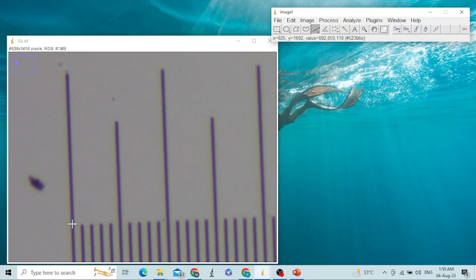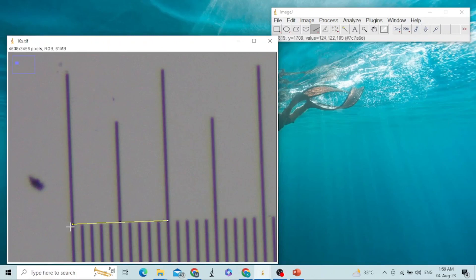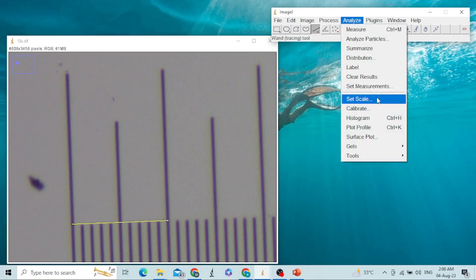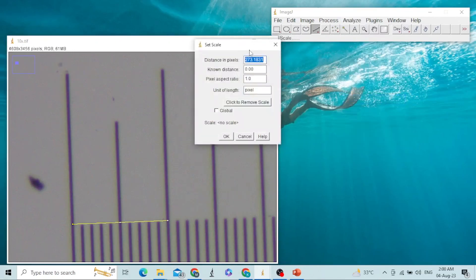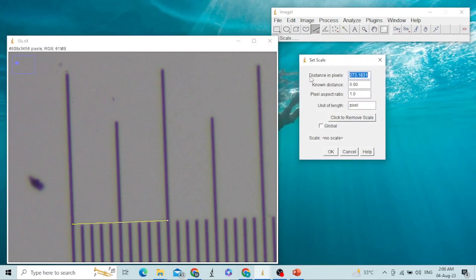I will draw a line from one large division to another large division. Keep in mind that this line should be straight with the divisions — it should start from the middle of the first division and end in the middle of the second division. After drawing this line, click on Analyze, then click on Set Scale. A pop-up window will appear showing information like distance in pixels, which is 273 point something. This value is dependent upon the camera used to capture the image.